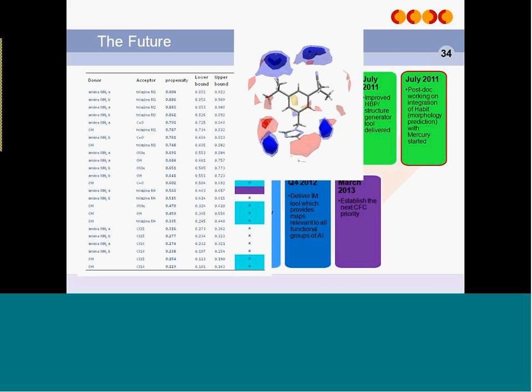We're also working on a tool that, again, extracts knowledge from the database to apply to systems that don't have very many or don't have your traditional hydrogen bond donors and acceptor groups. So what information can we pull out of the database that allows you to perform a risk assessment when you don't have those traditional bonding groups.